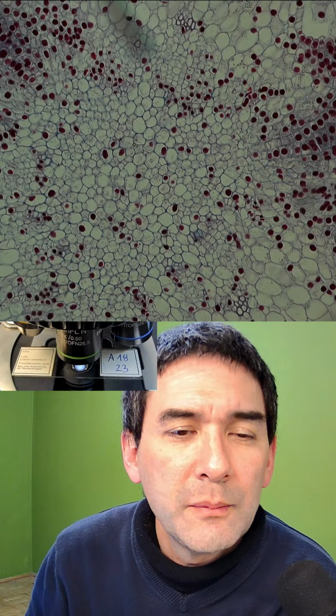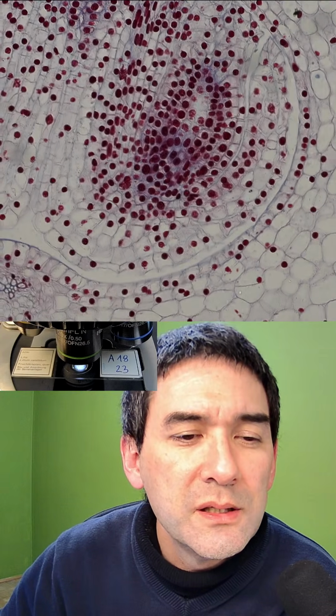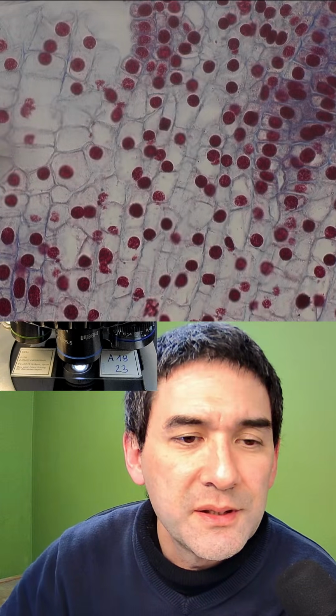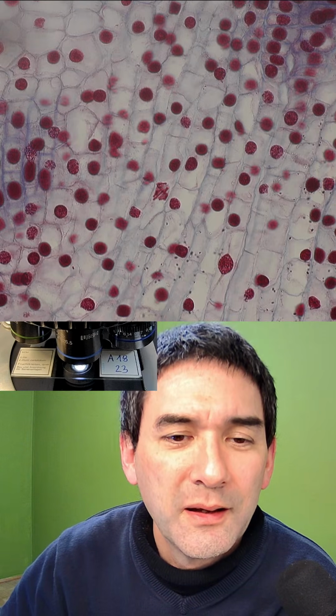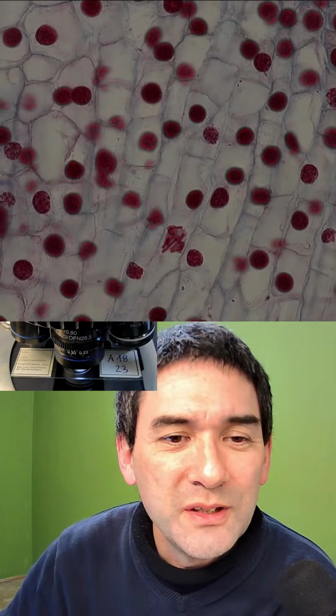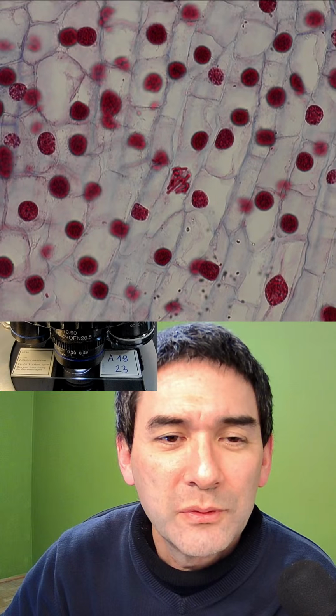Okay. Let's go up yet a little bit more with the magnification. Let's use bright field. And let's see, I forgot where it is. Each one of those round circles is of course, how do you say, a nucleus. Okay, so it was stained with a substance that stains DNA, and here we already have the thing. I already know the specimen, of course. And maybe you already noticed something that's in the center here. What do you see over here? Right in the center, right in the middle.